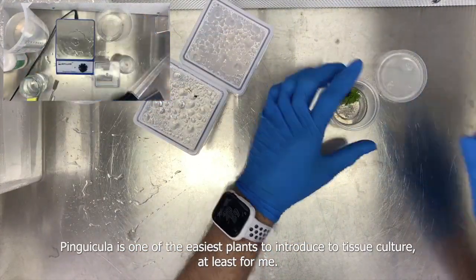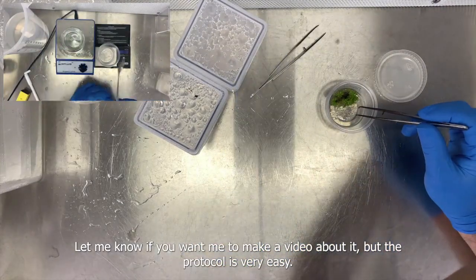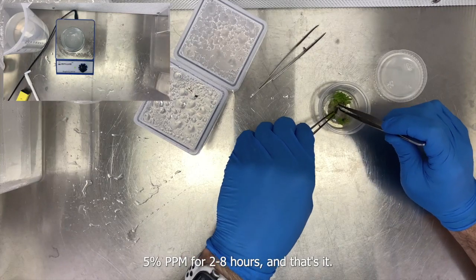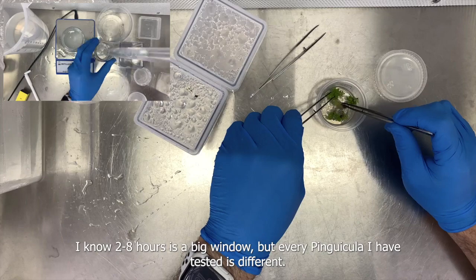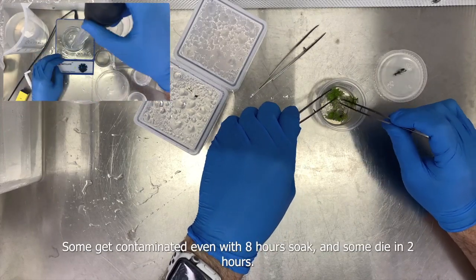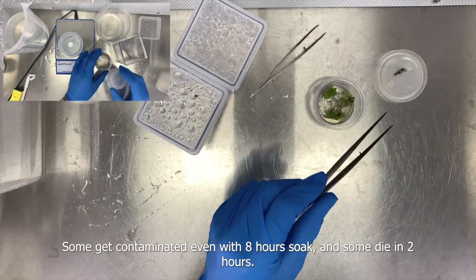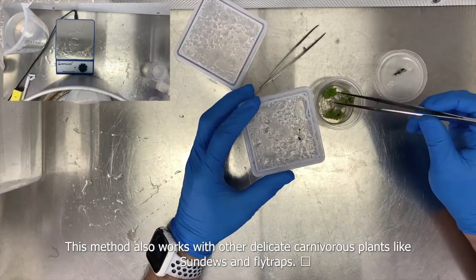Pinguicula is one of the easiest plants to introduce to tissue culture, at least for me. The protocol is very easy: 5% PPM for two to eight hours, and that's it. The two to eight hour window is wide because every Pinguicula I have tested is different — some get contaminated even with an eight-hour soak, and some die in two hours, so experimentation is needed.